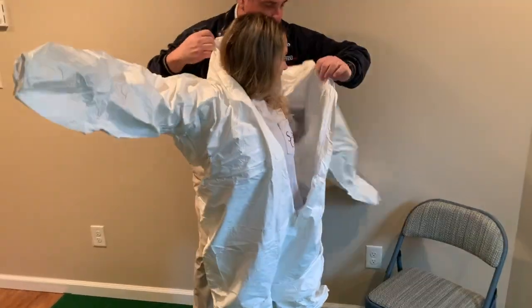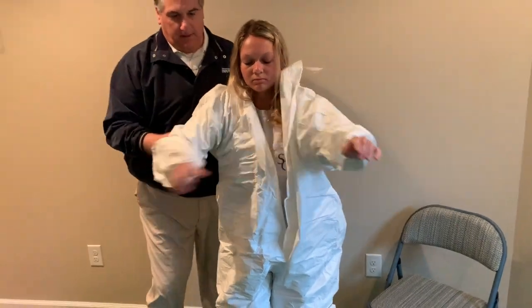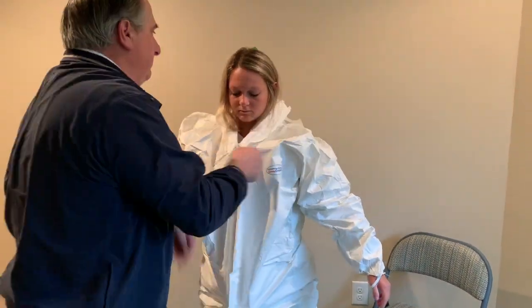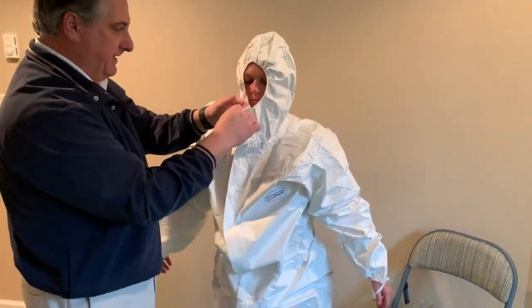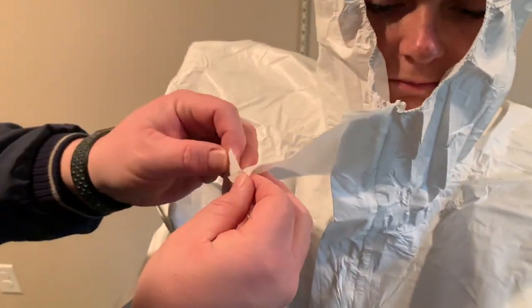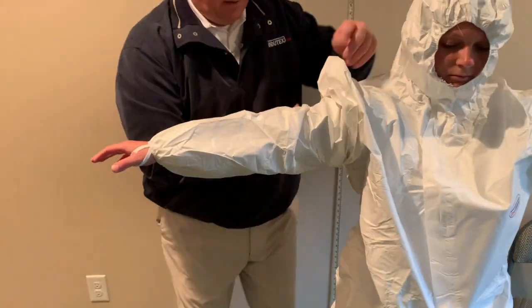Now we are putting on the coverall using the finger loops provided on the spray guard. We are zipping up the coverall. The double-sided tape for the zipper storm flap — we're going to remove that. And then we have double-sided tape for the respirator; we'll remove that and put that on.